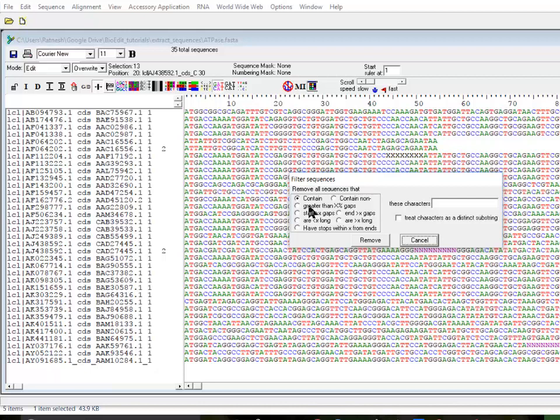For example, if you do an alignment and some sequences have a lot of gaps which don't align well with other sequences, you can mention here that you want at least 50% or any sequence containing that particular percent of sequences, or less than that or greater than that, should be removed.